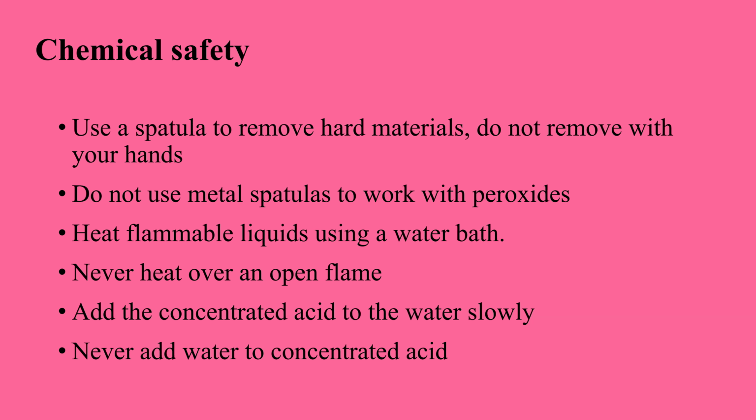It's not easy, because in most labs there are special rules or traditions, and you should be aware of what type of spatula to use, how to remove it, and where this material is stored, and this general information. For example, do not use metal spatulas for peroxides or acids.